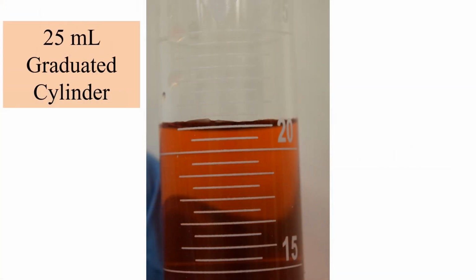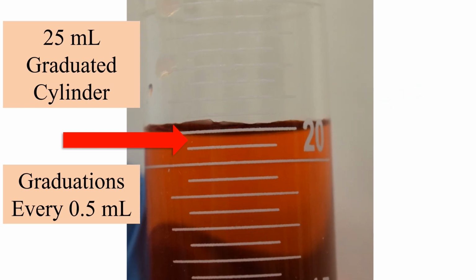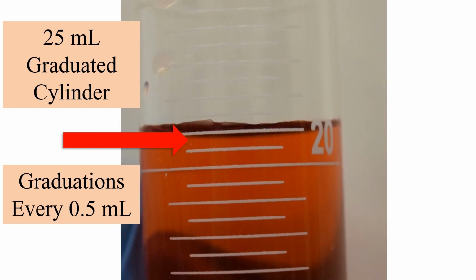Here is a 25 milliliter cylinder. The major graduations are every milliliter, and you'll notice that we can even see a graduation between every milliliter, so we have the resolution to read every 0.5 milliliters. You can see the meniscus goes past 20.5 milliliters, but doesn't quite reach 21 milliliters. I can estimate a volume between 20.5 and 21 milliliters, which is 20.75 milliliters. Notice the hundredths place here. More resolution compared to the 100 milliliter cylinder.